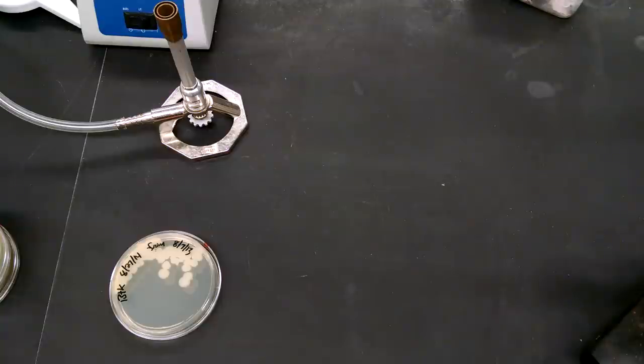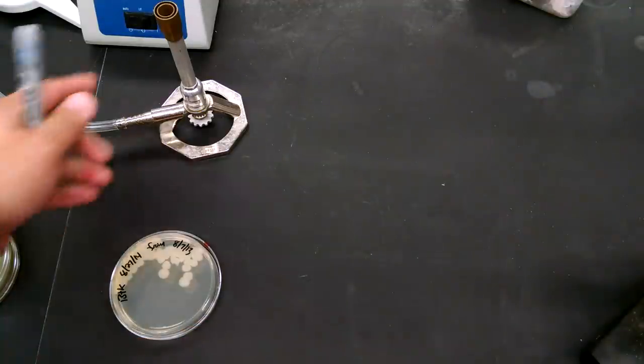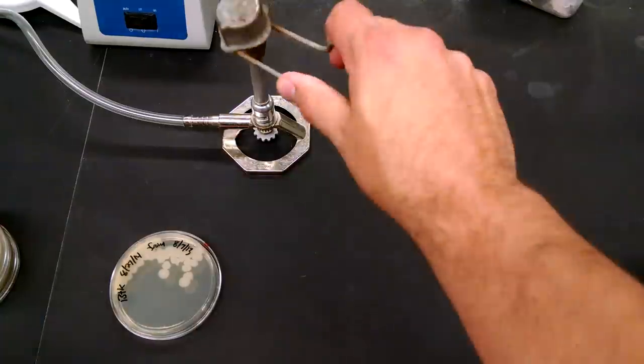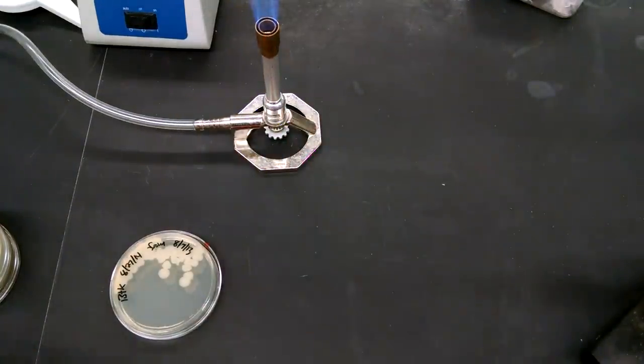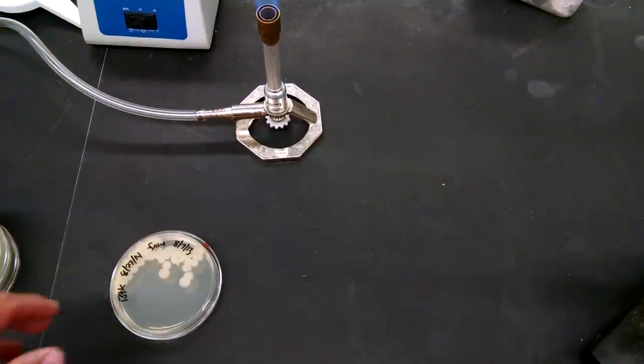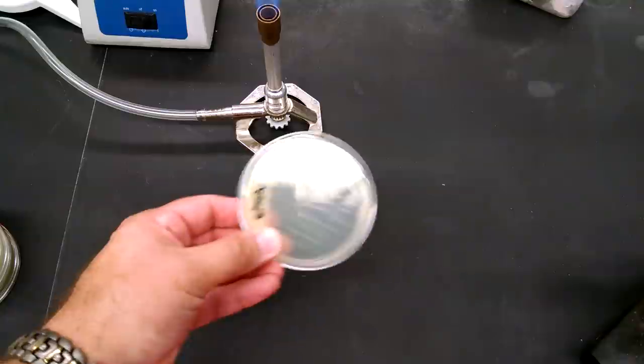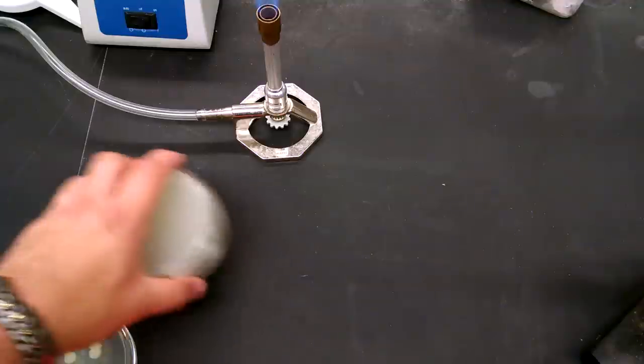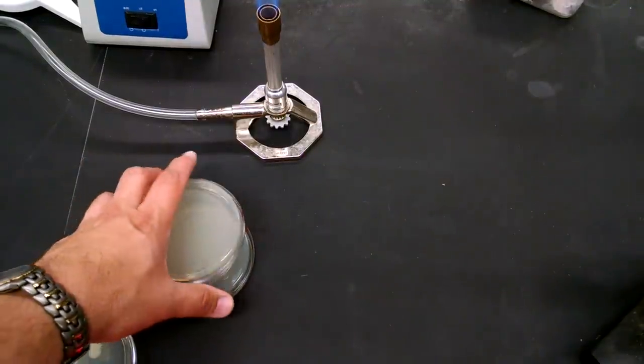Today we're going to demonstrate how to streak a plate. One thing we want to do is make sure we're working aseptically, so we have a Bunsen burner going in the general neighborhood of where we're working. We're going to need something to streak from, so we have some BTK here, and we're going to need something to streak on, so we have some plates.